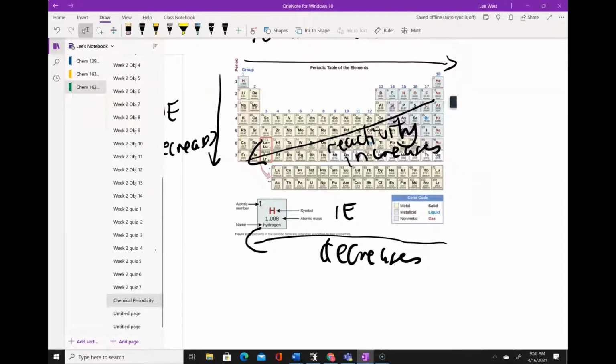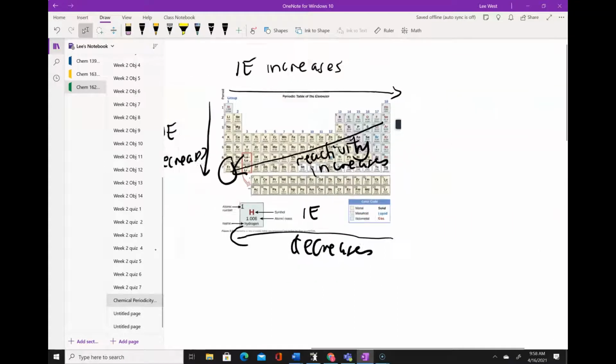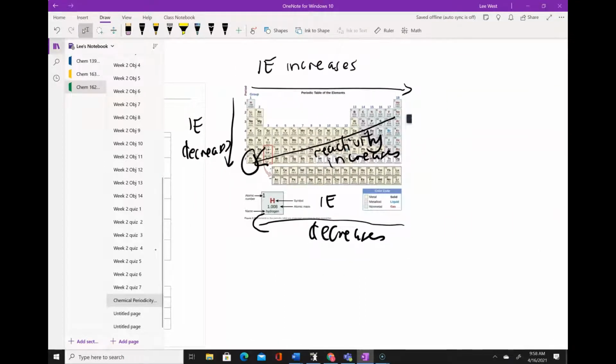As that becomes easier as we move towards francium, we might expect reactivity to increase in that way. And we're going to have that in the back of our mind as we look at this. So we actually look at 6 different metals, I think it is.